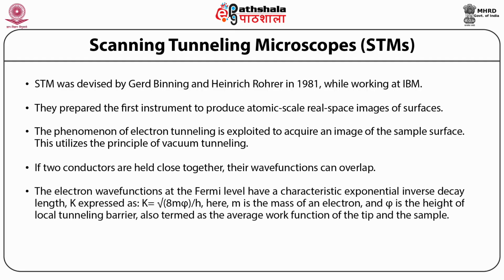The electron wave functions at the Fermi level have a characteristic exponential inverse decay length, that is k, which is expressed as k equal to square root of 8 m phi by h.